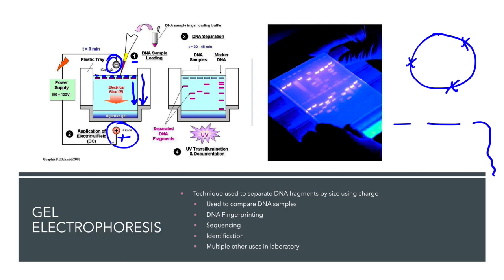And so as these molecules run through that agarose gel, the smaller ones move very quickly, the larger ones move much more slowly, and what I end up with, over here on the right, is separated fragments. Where I see these bands on my gel, I have a collection of DNA fragments that are of the same length. So if I cut this into 3 fragments, I would look for a lane that would have 1, 2, and then maybe a 3rd fragment down here. And this would be the plasmid that I cut that I'm looking for.